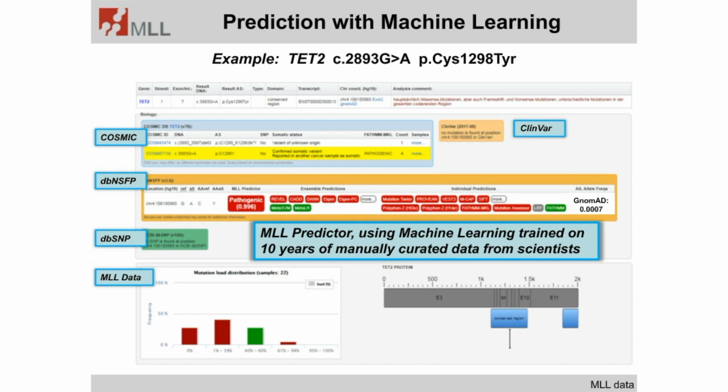In addition to the publicly available sources, data from our LAMP system is shown as well. On the left bottom, you see the respective TET mutation that we found in this patient. We used the aggregated variant allele frequency as a metric to distinguish between mutation and SNP. The reason is that typical SNPs will be presented with either 50 or 100% variant allele frequency, whereas somatic mutations are below 50 or between, let's say, 52 to 99.